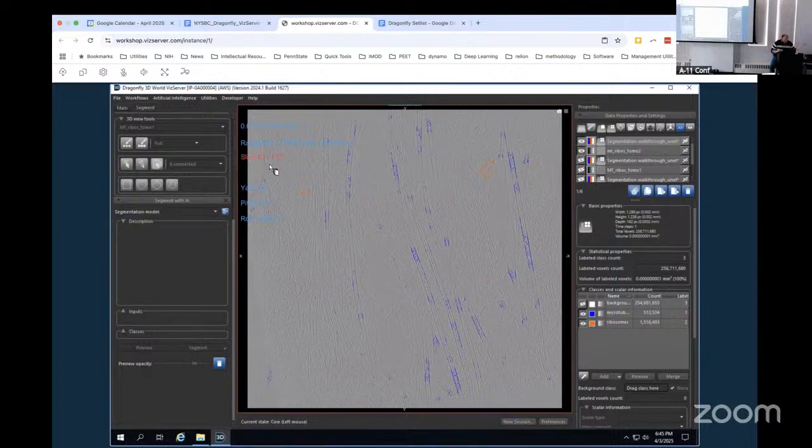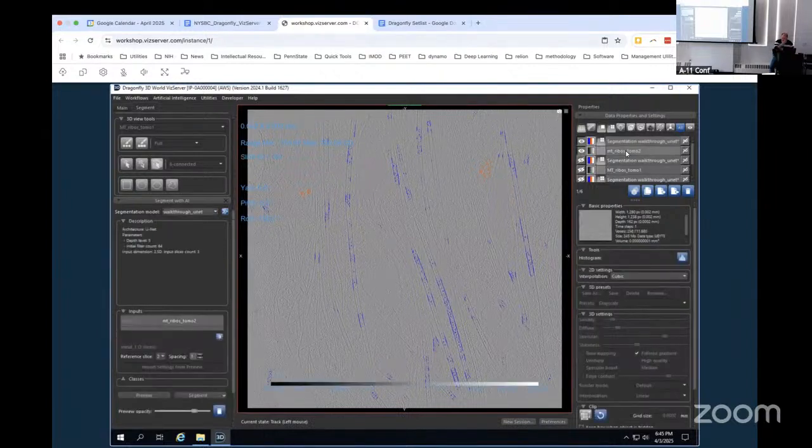This isn't the best one, but let's say, okay. I'm going to take something up here in the top right corner because there's a microtubule running through here. There's some membrane that we'd like it to ignore, and there's a cluster of ribosomes right here.